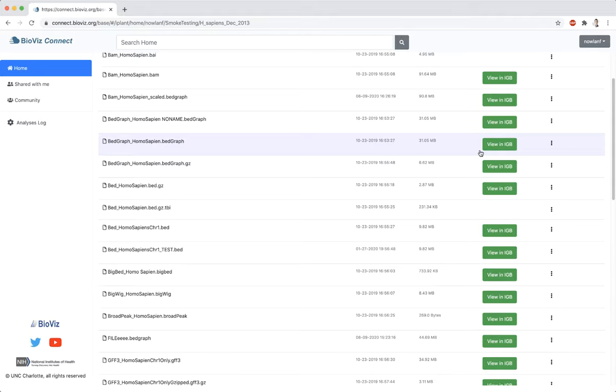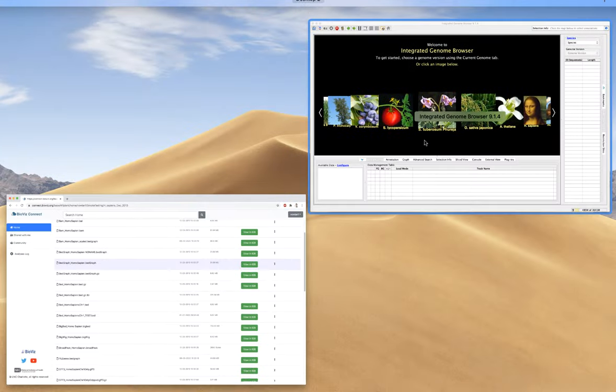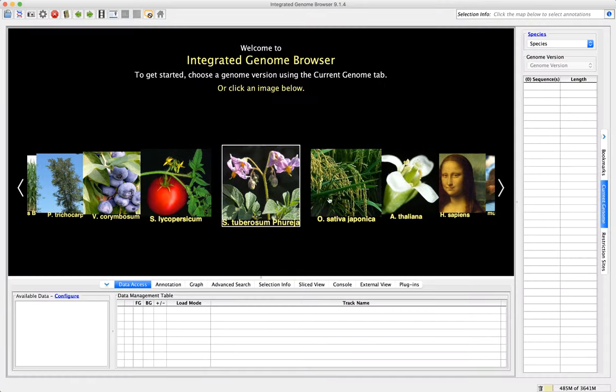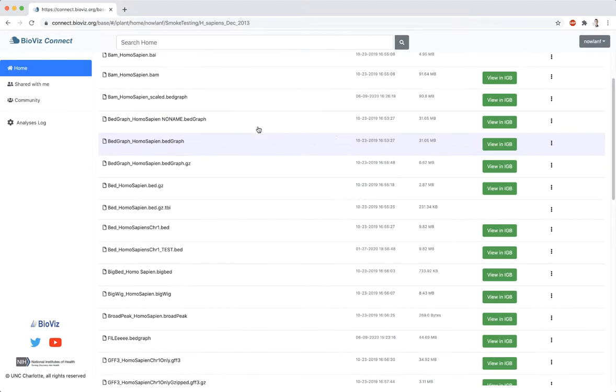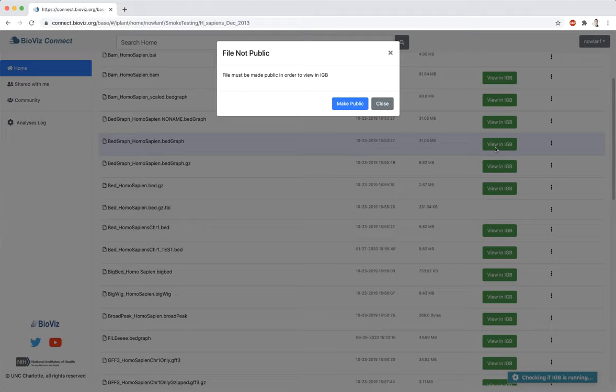Before clicking on View in IGBI, make sure to first start IGBI. Note that files must be public in order to view in IGBI. If a file is currently private, a notification will appear asking if you would like to make it public.